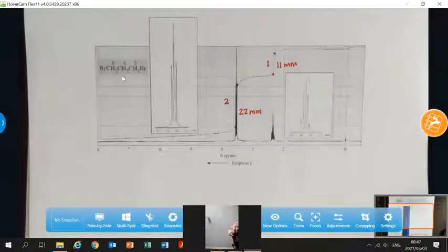And the symmetry here is very easy to see because you have a central carbon atom with 2 hydrogens on it. And that's denoted by A. So if you look at this carbon, 2 hydrogens, I can't tell the 2 hydrogens apart. Right? I can't tell those 2 hydrogens on that carbon apart, so they are equivalent. So I have 1 hydrogen on the carbon here, another hydrogen there.